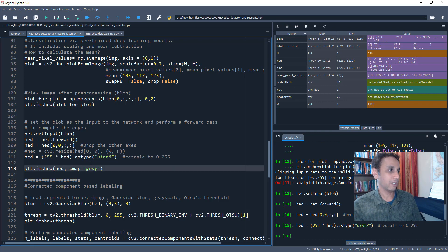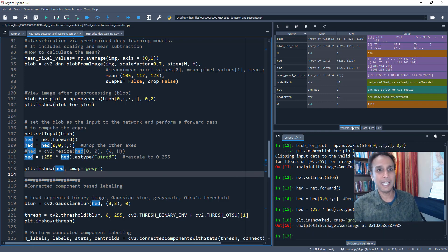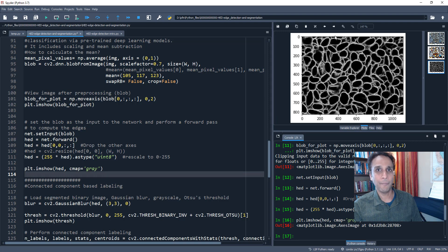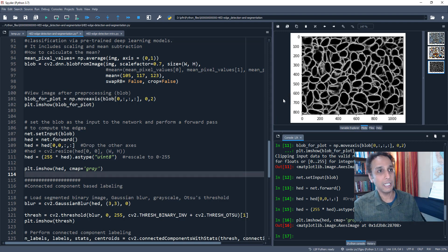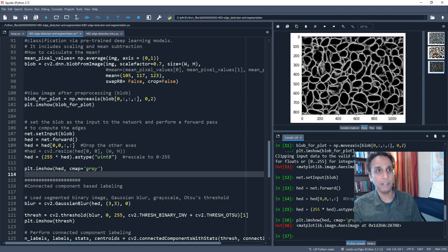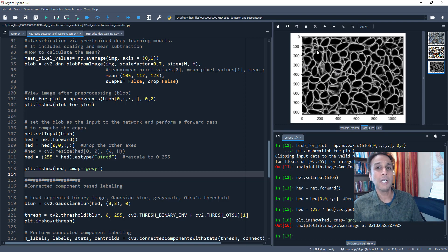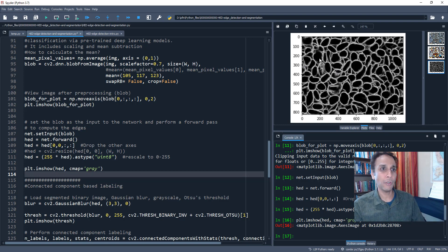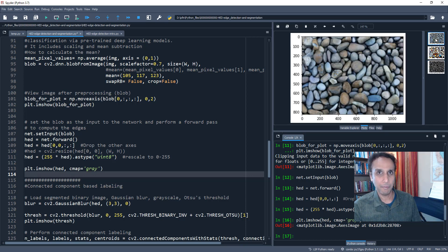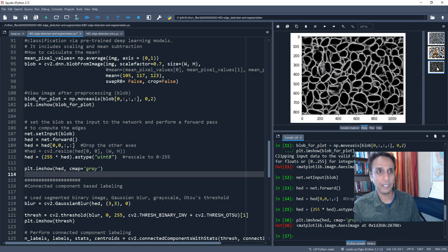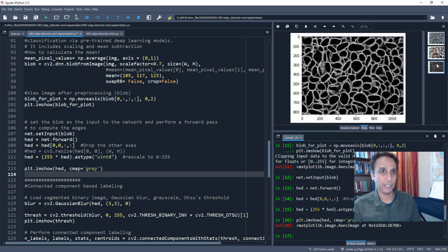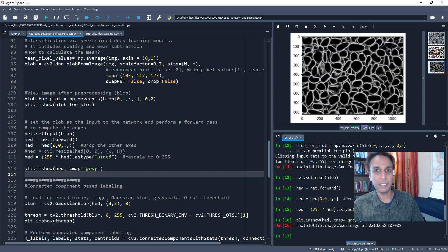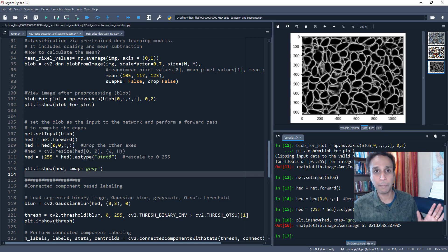Okay. So first, because I said plotting, let's go ahead and plot it. And if I go to plots, now you see how edges are taken care of. If you don't have that layer, the crop layer, then you saw how the entire image is moved to the bottom, right? Yeah. So that's the magic of this crop layer. So that's exactly why we need to use it. Okay. So now we know that, if you go back to the original image, this back and forth, that is perfect. That's an amazing job for edge detection. I'm still amazed at how good it is. Go ahead and play with the scale factor and the mean just to see how things change. But I am super happy with where we are.